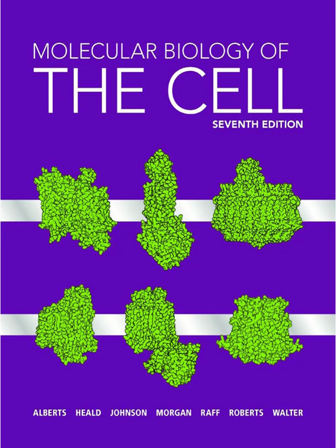What does the mirror do? The dichroic mirror is clever. It reflects the shorter excitation wavelength towards the sample, but allows the longer emission wavelength to pass through towards the detector. It efficiently separates the excitation and emission light paths. Okay, so what can you do with this?